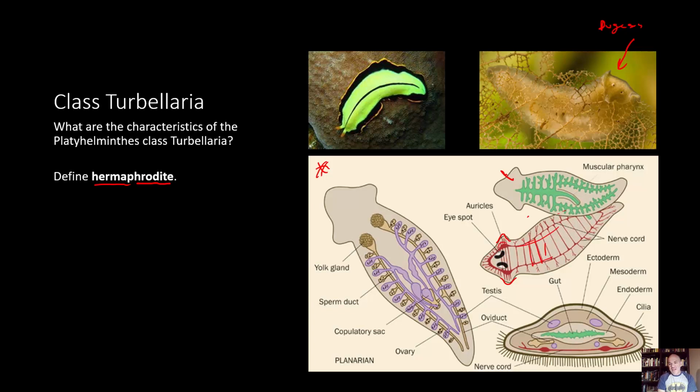And then you have a high concentration of nerve cells or ganglia up there towards the front. So this would be what I was talking about earlier. You have a higher concentration of sense organs and nervous tissue towards the front or anterior end. And I called that a while ago cephalization, right?